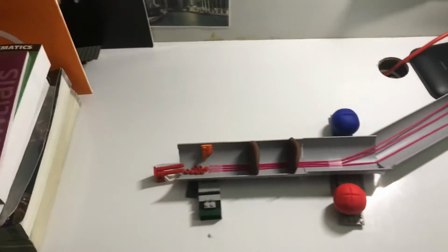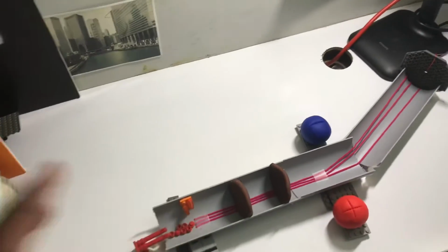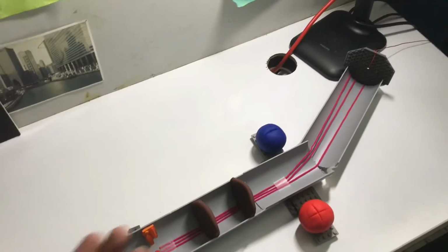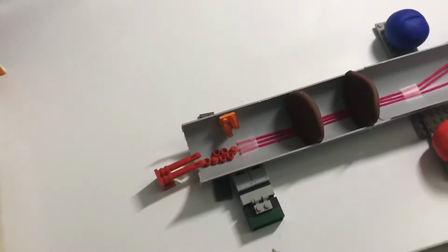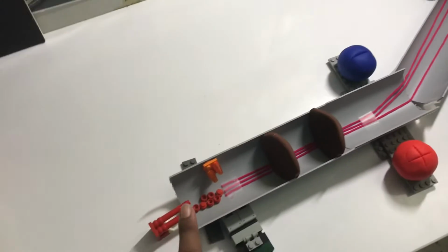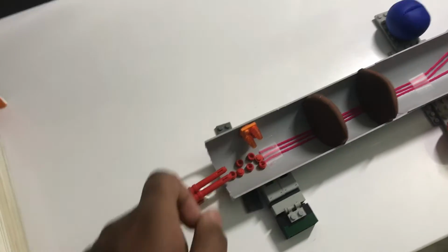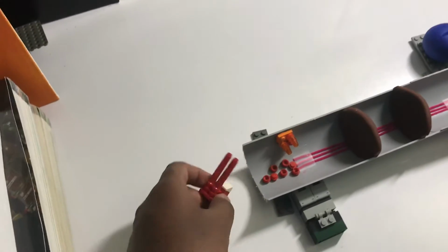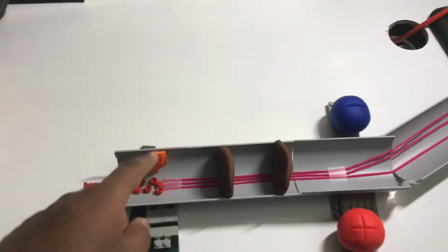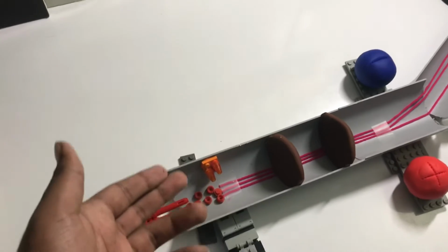front of us. There are 5 different stages in a mass spectrometer device. Some say 4, but it's usually considered as 5. So I will take you through all of them and explain to you how the device works. Before any of the processes start, the sample element needs to be inserted into the mass spectrometer. This can be represented by these studs here. They're inserted into the device with this contraption, which represents an inlet, basically an entrance into the mass spectrometer that allows the element to enter the contraption.